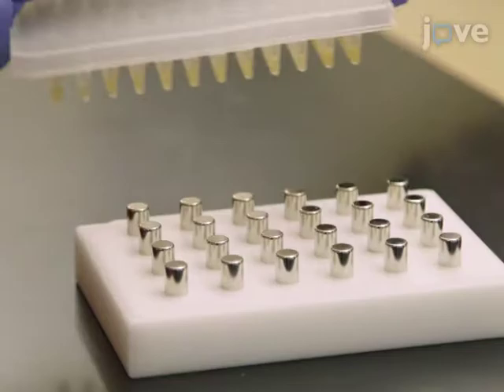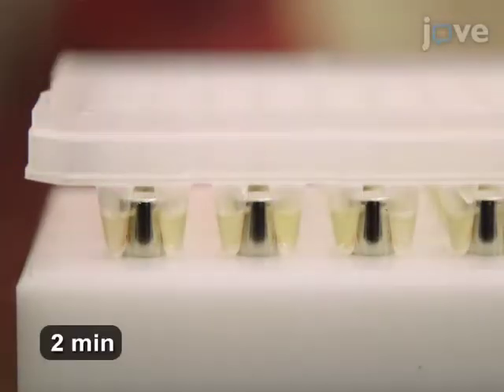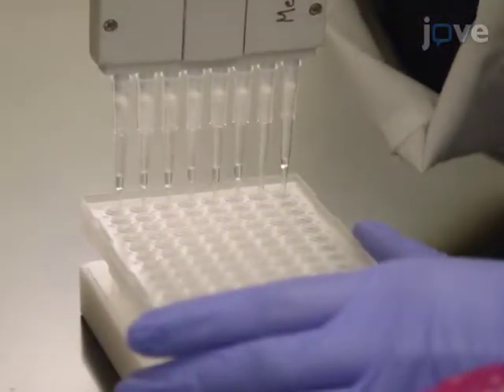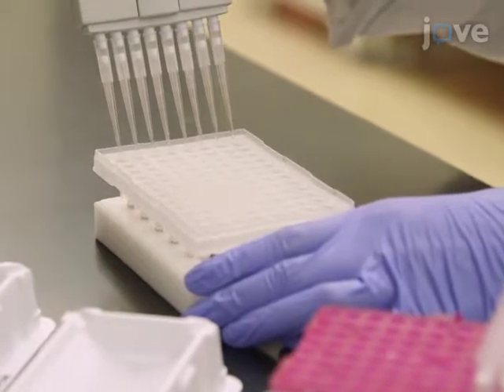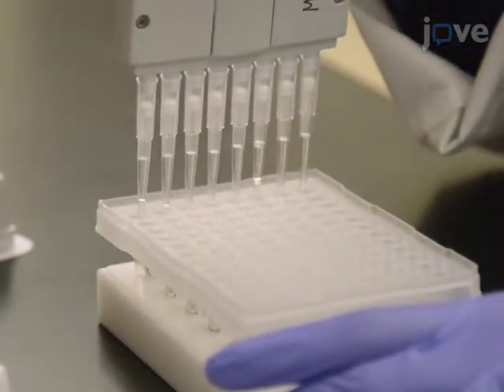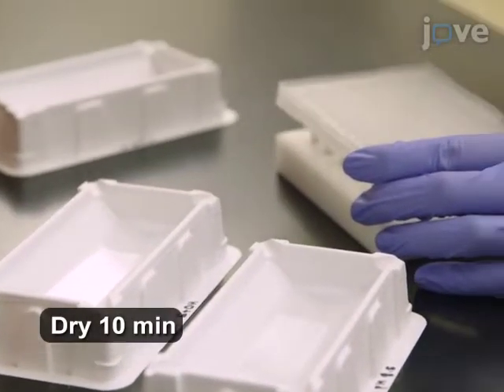Next, place the PCR plate on a magnetic stand and wait 2 minutes for the supernatants to clear following magnetic collection of beads. Then remove and discard the supernatants. Next, with the plate still on the magnet, fill each well of beads with 200 microliters of fresh 80% ethanol and wait 30 seconds. Then, carefully remove the supernatant. Repeat this wash step once, and let the beads air dry for 10 minutes.